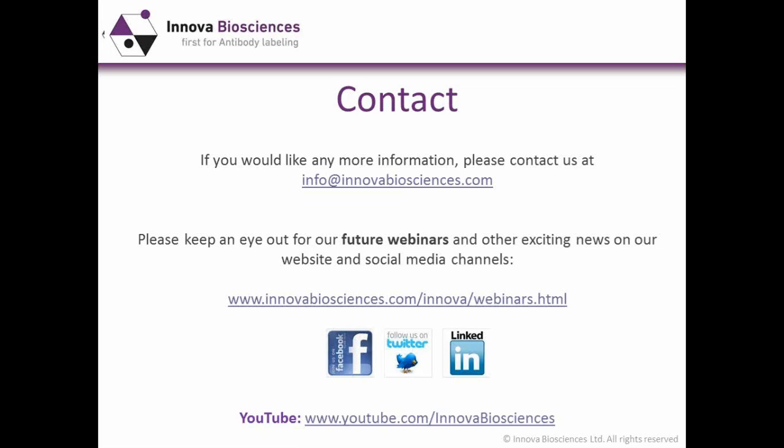That's going to be the case with most proteins, and thereafter the main criteria is to adjust the reaction conditions according to the size of the protein that you're working with. Lightning Link kits are designed to use with antibodies. If you have a protein that is half the size of an antibody, then you should use half the amount of material that you would typically use with an antibody for that product. For more specific details on conjugating your particular protein, I'd suggest you contact us directly and we can give you some advice about exactly how to adjust the reaction conditions.